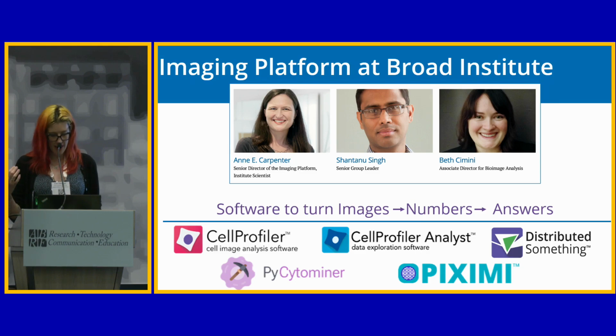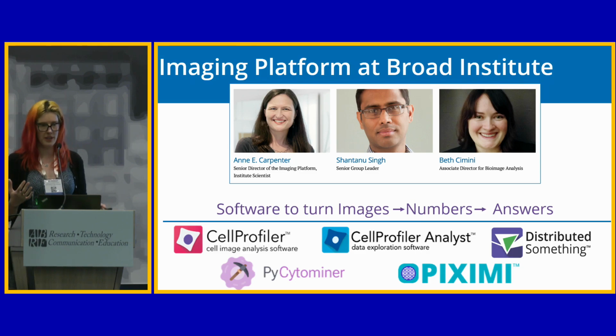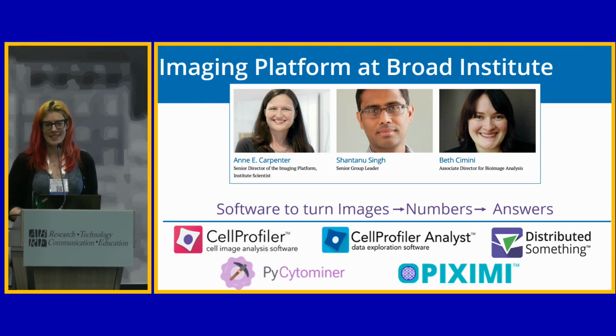So we have a number of software tools that we write and maintain. Hopefully anyone that works with images has at least heard of CellProfiler. It's been around for 20 years, and we are still very actively developing it, a very popular tool in imaging, but we have a number of other tools, some of which I will touch on in the talk.